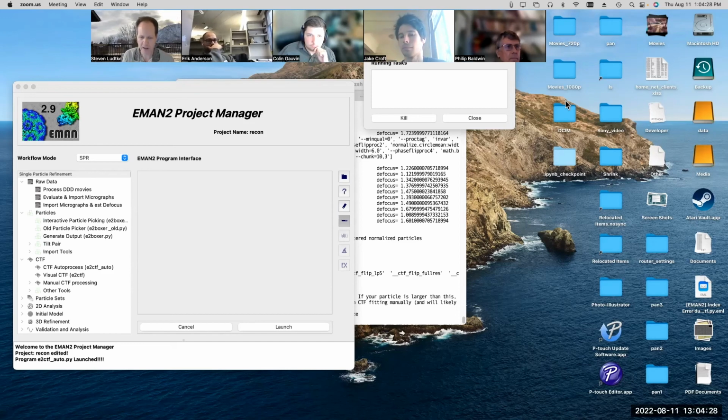You'd have another nested layer in your loop, right? So you'd randomly orient the 3D particle, save that to a file, and then you'd have another loop where you generate the tilt series for that one particle and save that in another file. But fundamentally it's about the same. The other thing is obviously you'd add a much higher level of noise to the raw particle data. Yeah. Cool. Thanks.